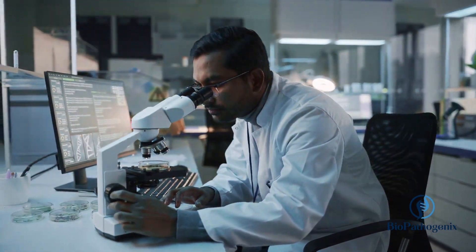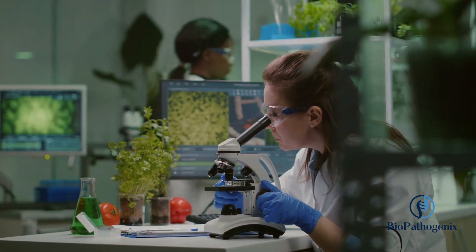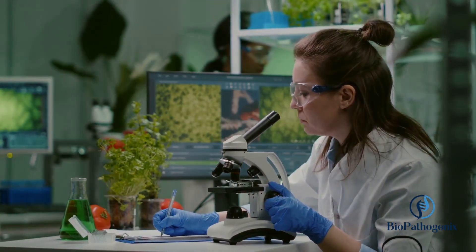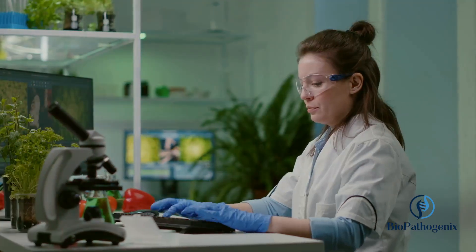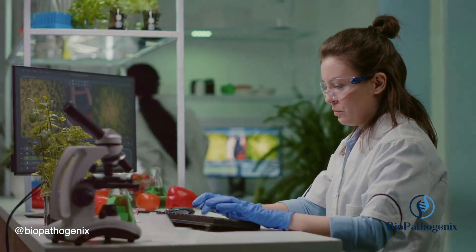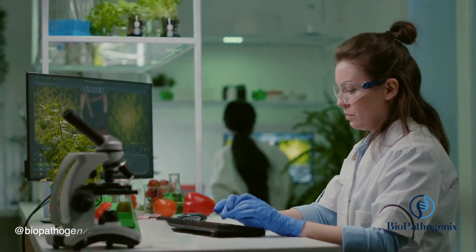Where specific genetic markers can be identified and characterized, giving us the power to select the strongest, most resilient plants for breeding — that's precisely what LAMP PCR enables us to do. The process is as intricate as it is fascinating. It all begins with the extraction of plant DNA, the very blueprint of life.